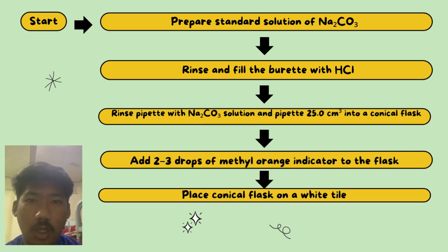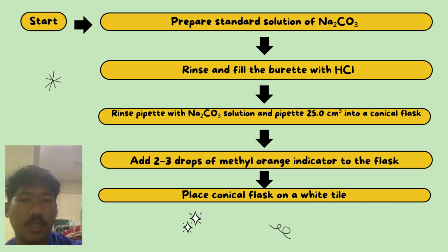So we start by preparing the standard solution of Na2CO3, or we call it sodium carbonate, and after that we rinse and fill the burette with HCl.